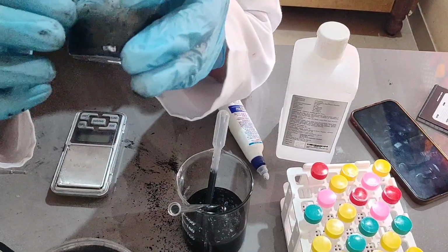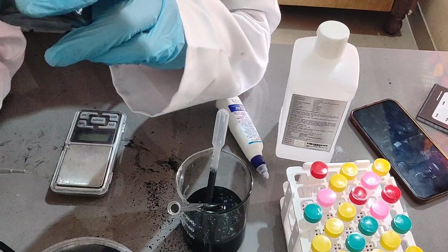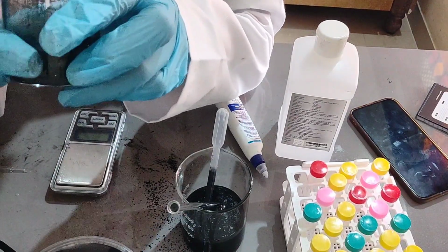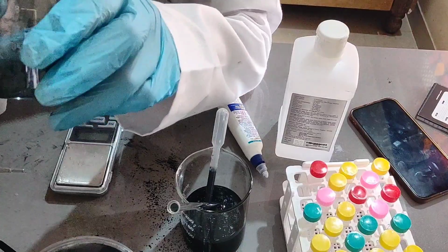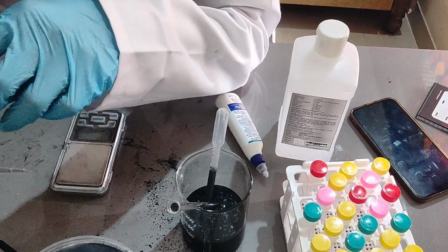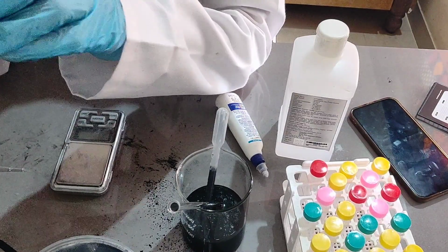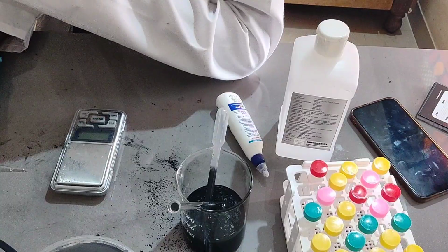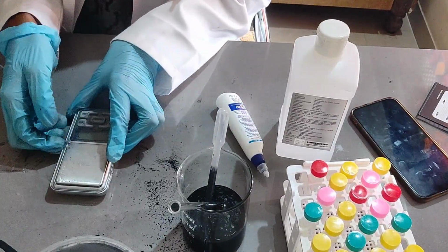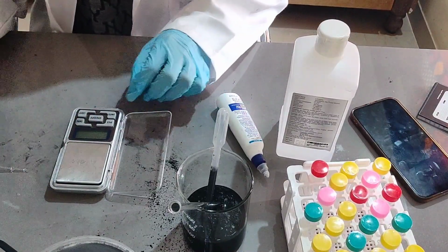I feel like it's much better than the ethanol one, because when I was cleaning the beaker when we were doing the ethanol experiments, the graphite layer didn't get suspended enough. There were just clumps of graphite, and not a clean, thin distribution, which you can see in this one. So I guess isopropyl could be better. Let's see.